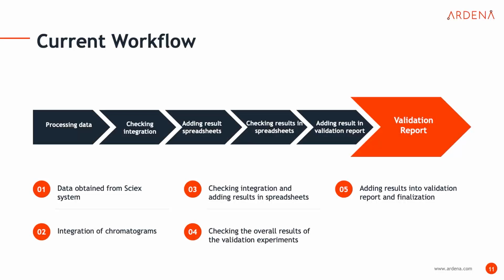Let's take a look at the typical current workflow at Ardena. Data is acquired from the LC-MS system. Chromatograms are manually integrated by an analyst and checked by another analyst, to have a four-eyes principle. Then results are copied into spreadsheets for calculations. Analysts manually check and verify results.